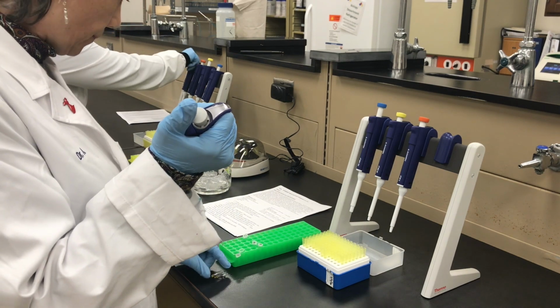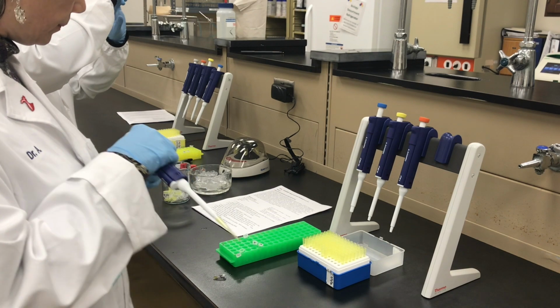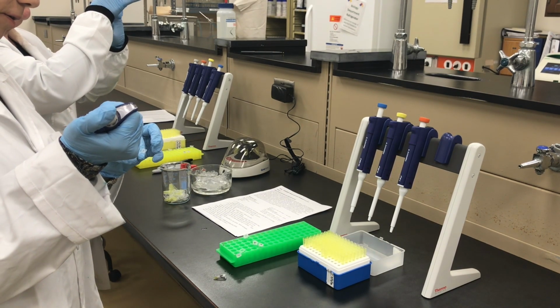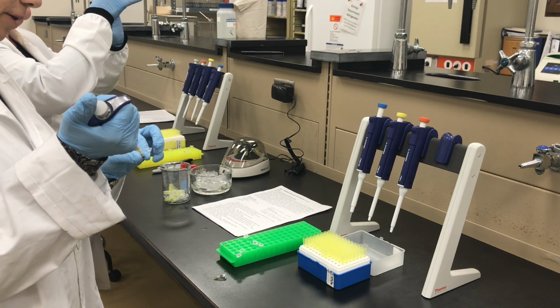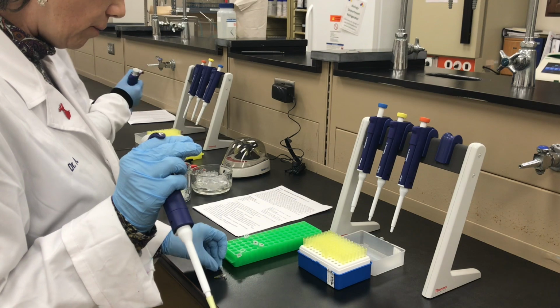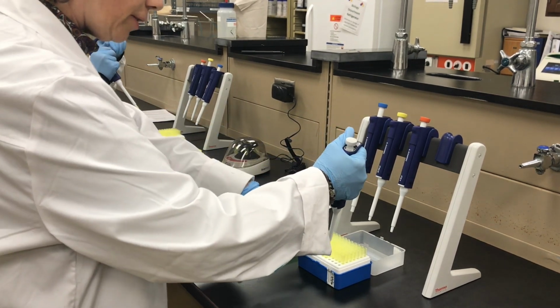D. And that goes in tube number 1. It is very important to keep track of what's going where, so that when you run your samples on a gel, you know what the heck is in each sample on the gel.